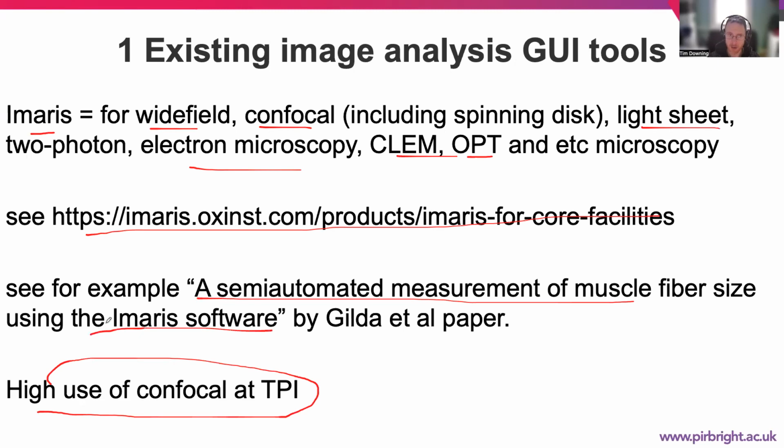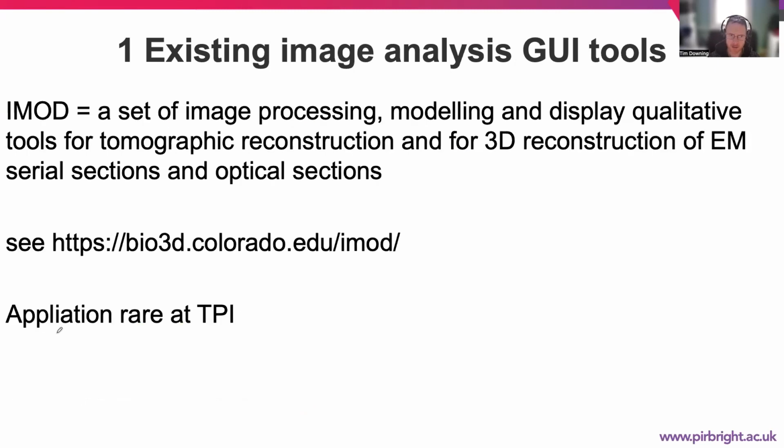kind of works. An alternative that is less commonly used at the Institute is for looking at kind of 3D reconstruction and tomographic reconstruction of cell structures and cell movements. And there's more information at this site here.